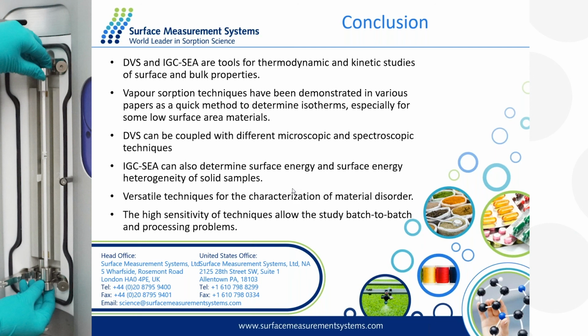If this preconditioning changes the structure, for example higher temperature will remove some of the water on the surface, the longer time will give a cleaner surface, and that will probably affect the surface area in the final result. But if the preconditioning at ambient temperature doesn't affect the surface of the material, the result should be the same. I hope this answers your question. Yes, thank you so much.